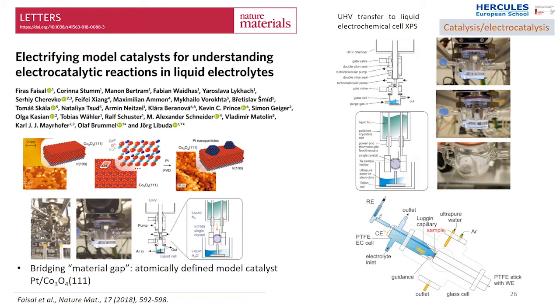And this particular paper is dealing with the problem of the so-called materials gap, because in heterogeneous catalysis, most of our current fundamental knowledge originates from surface science studies on single crystals. But they are too simple compared to real materials.